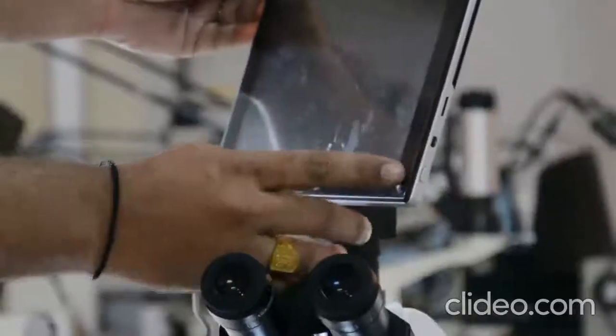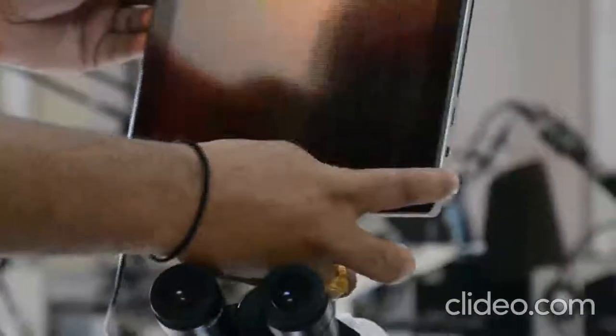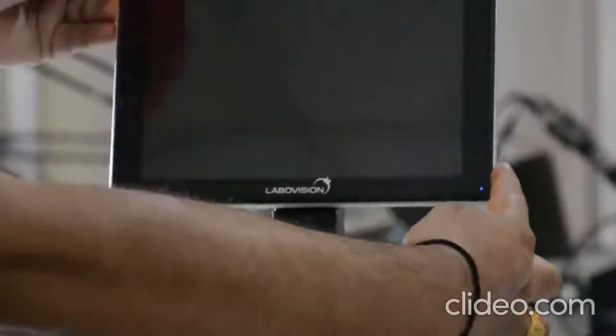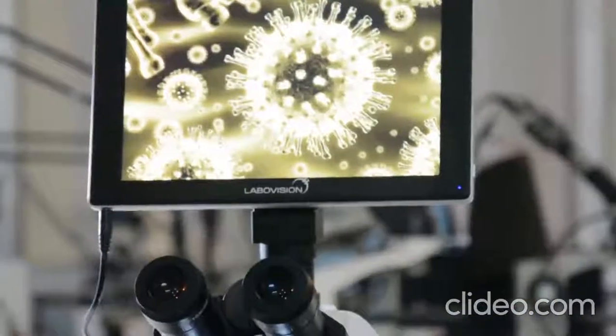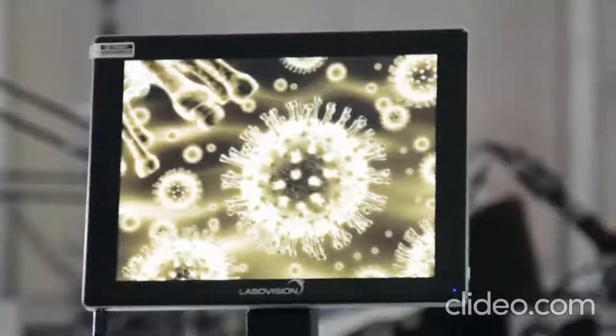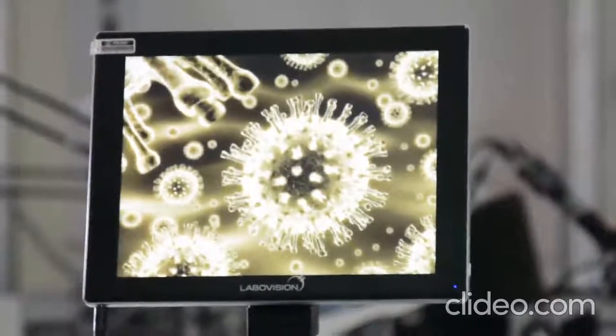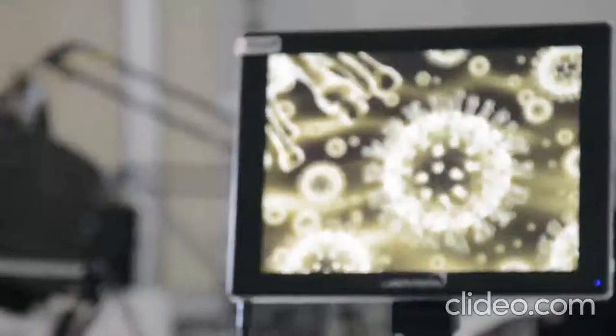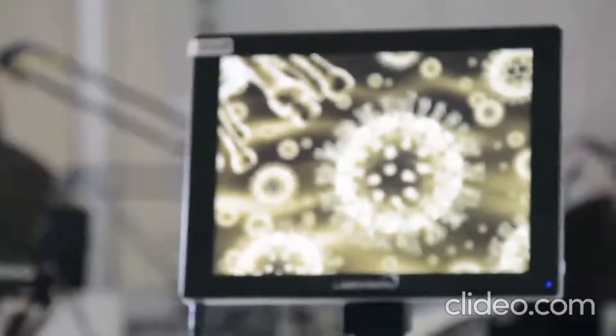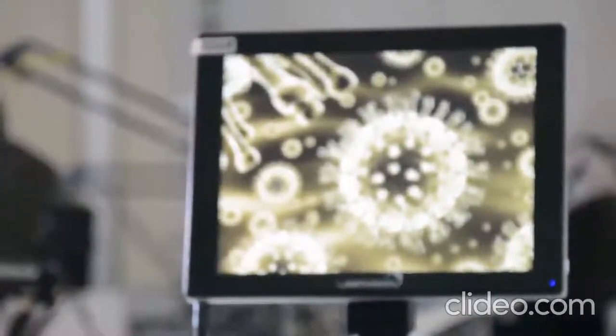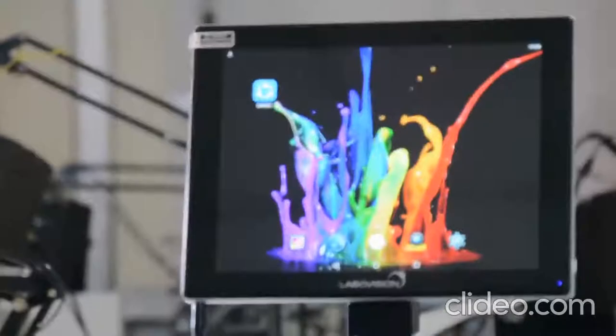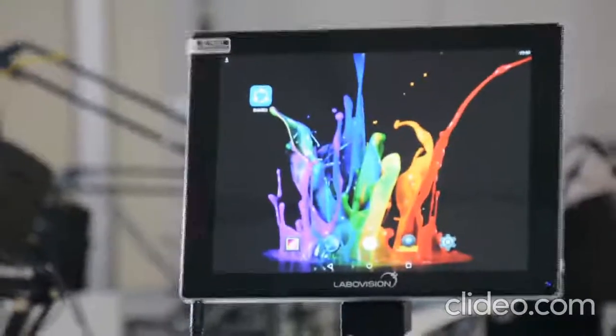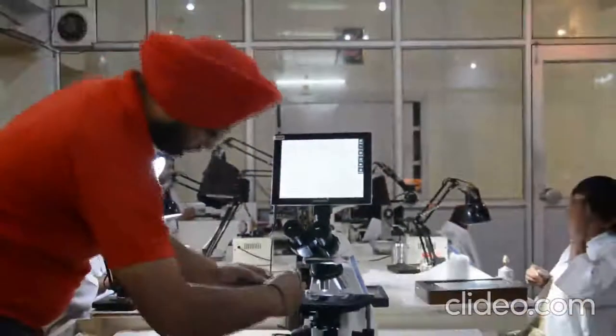Now this is the switch on switch off button of the LCD screen. You have to slightly press. Now you can see. Now we will put the slide on the microscope.